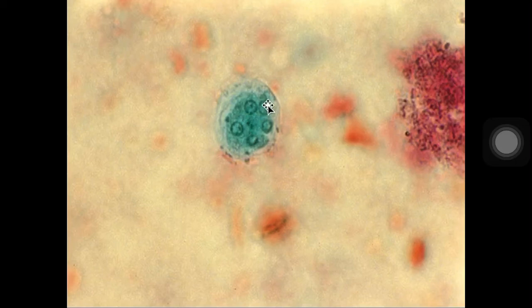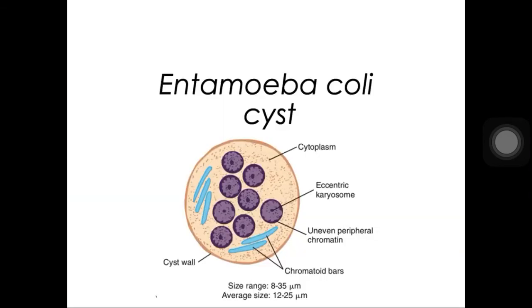1, 2, 3, 4, 5. 5 yung nuclei dito. Okay? Na visible. This one is using trichrome stain as a permanent stain. Okay? Again, permanent stain still offers help for the diagnosis of your protozoans, for confirmatory purposes. Okay? Next po tayo.